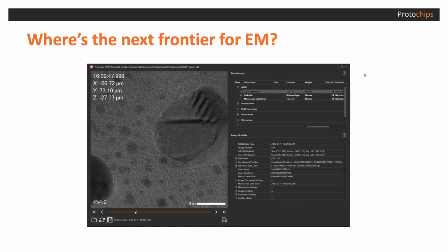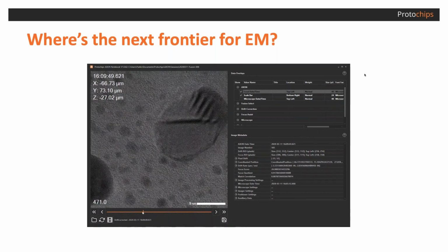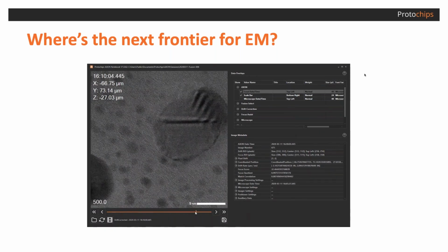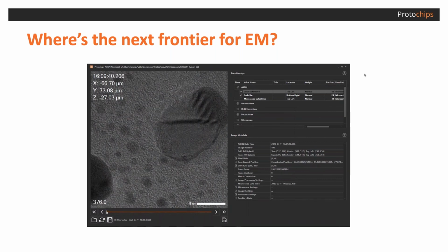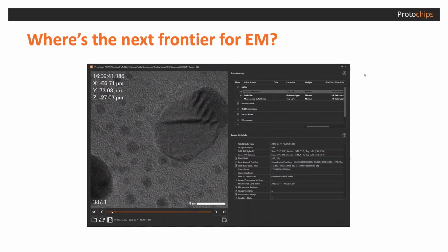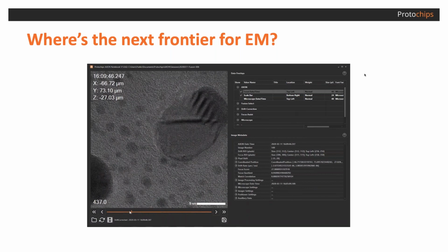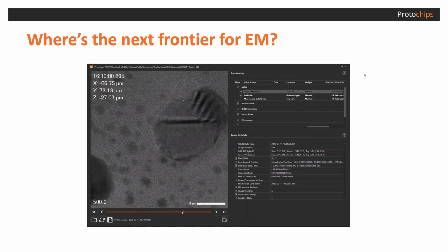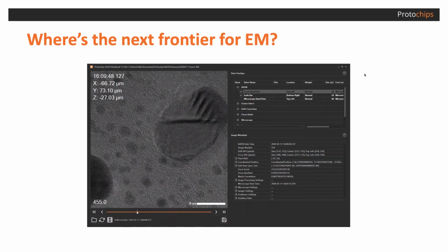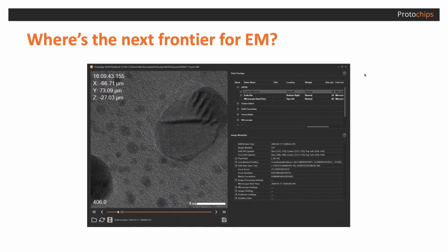And what that means, basically, is that we have taken all the images, they've all been aligned and stacked, and they've all been brought into focus, and that was done live during the experiment. And each image has been stuffed with the metadata from the experiment. And what you're really looking at now, I think, is the power of seeing all of this brought together. You could imagine how much easier it is to draw some sort of conclusion based on an effect that occurs perhaps due to a temperature change or something else that you've set up.